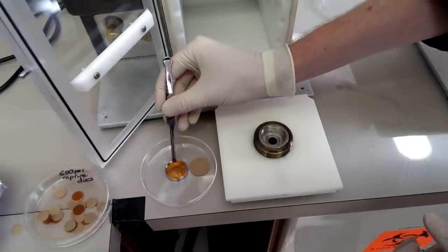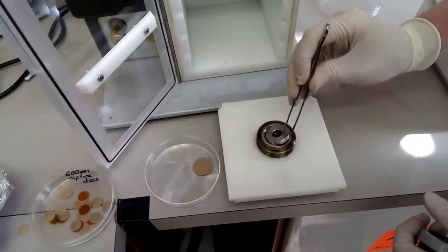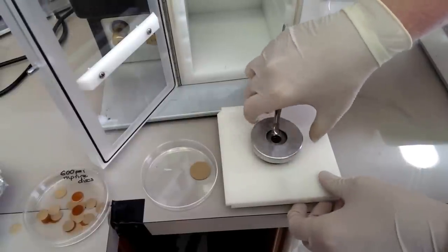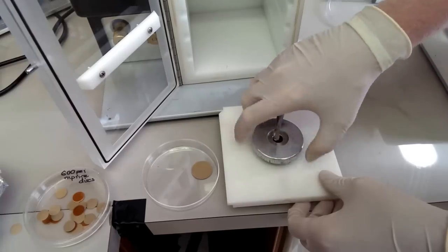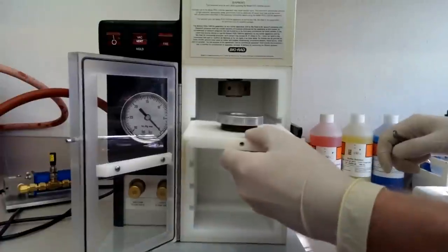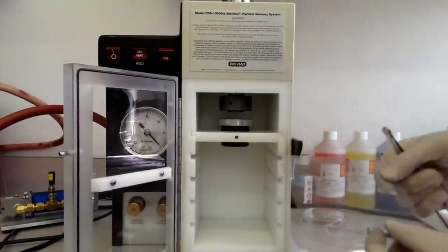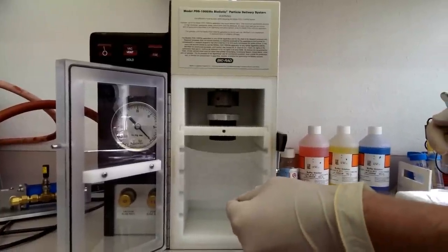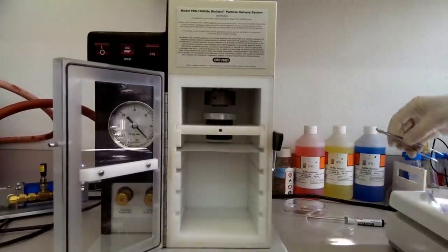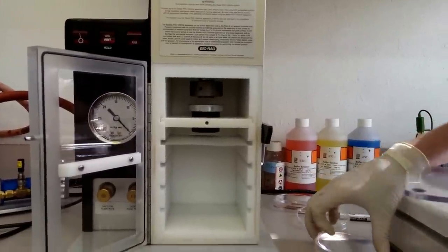And so now we'll put this piece in here. I'm going to put it upside down because the shockwave will go down. And that's the way we're firing the DNA. All right. We then need a nice little stopping screen. You don't want the actual membrane going into whatever tissue you're bombarding. And then finally, that means we're ready for the tissue.